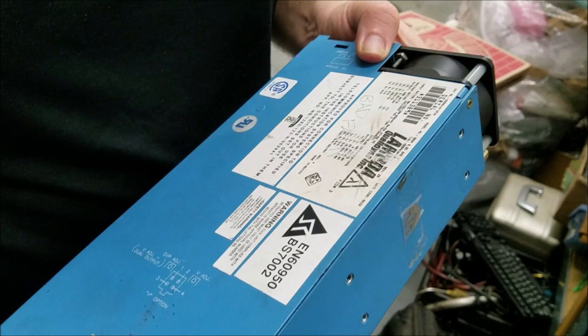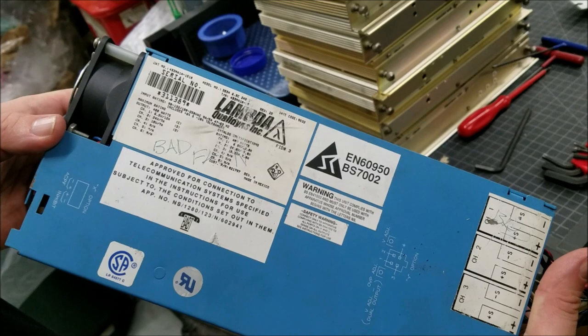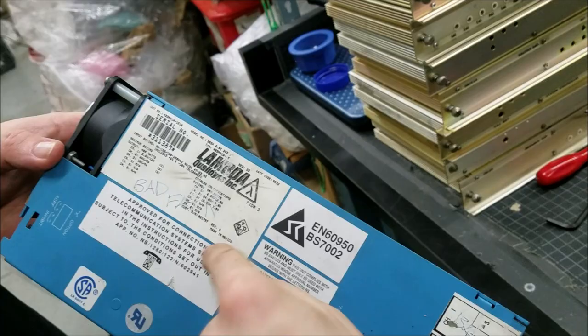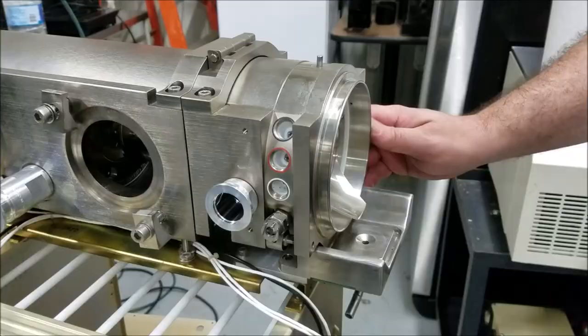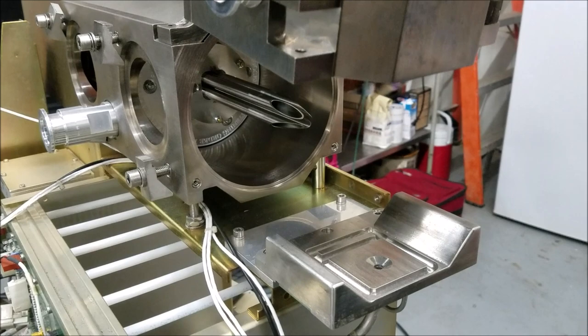I'm going to read off this back here: 6.5 V, 12 amps; 24 volts, 7 amps; 18 volts, 7 amps — and it basically says the same thing over again. Lambda — good brand, bad fan. My friend had a power supply that said 'bad fan,' so I scribbled out 'bad fan' and wrote 'use in well-ventilated areas.' He thought that was great. Alright, let's take a look at the inside of the quadrupole mass analyzer.